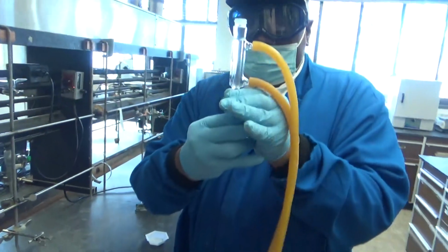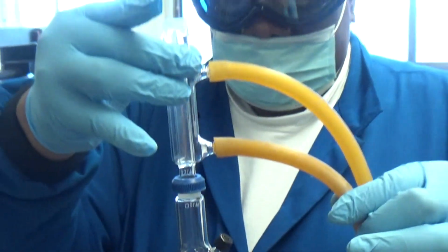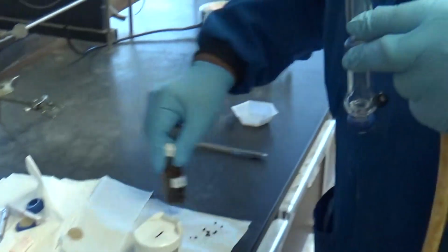See, it was sitting like that. Let me see. Let's see the whole thing. Okay, so you have the Hickman still at the bottom and the condenser up top, and you're going to flow the water in from the bottom up to the top. Yeah. We need a thermometer adapter, which is here. Thermometer adapter. Thermometer.